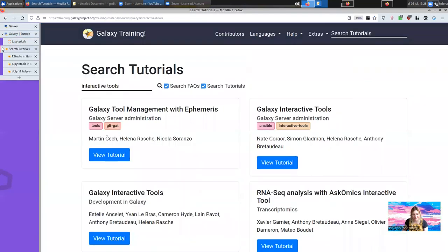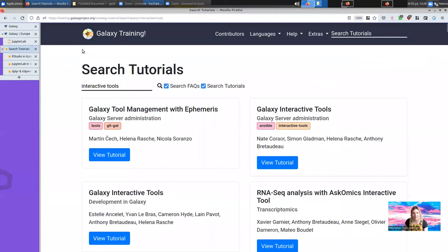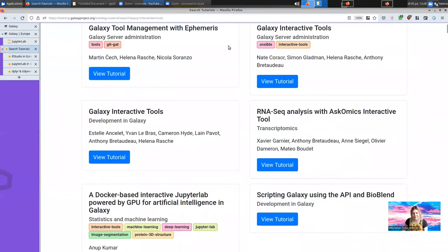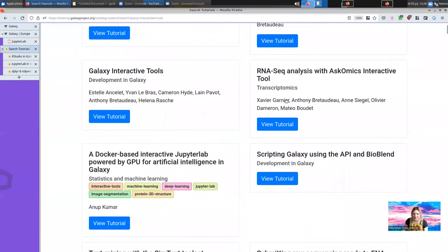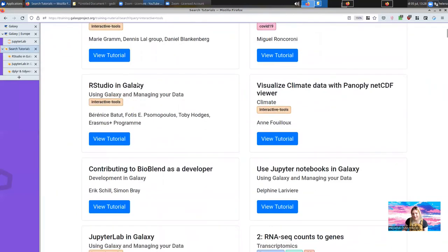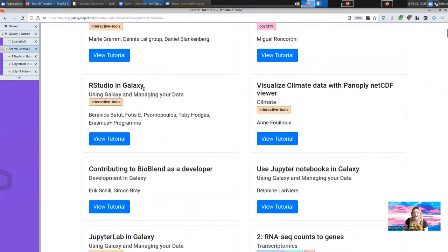If you're looking for training on interactive tools, there's a lot on the Galaxy Training Network. Just look for interactive tools. There's a couple on development and administration, which may not be so interesting, but if you want to see lots of examples, look for everything tagged interactive tools. Here you'll see primers and how to use RStudio in Galaxy, visualizing climate data. You can learn a lot from there.